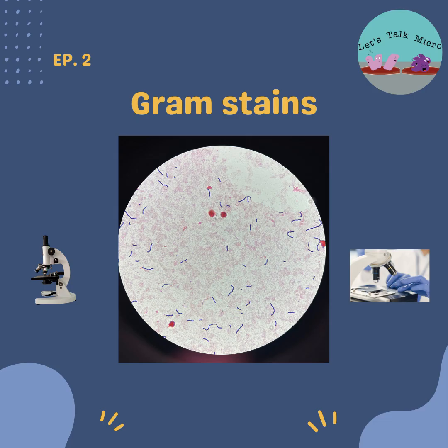You flood your slide with crystal violet and you let it sit for 1 minute. Once that minute is up, you rinse your slide with distilled water. Then you will add your iodine and leave it for 1 minute. Rinse with water. Then you will decolorize the slide with your ethanol or the decolorizer that your lab has for 3 to 5 seconds.